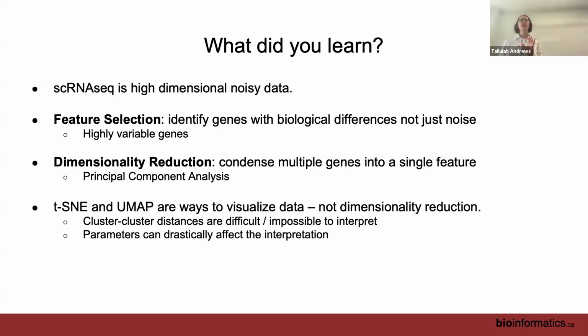It's sort of in between a dimensionality reduction method and a visualization method, because it's trying to preserve some degree of distances in the data, but it's very focused on trajectories. So it's quite good at representing trajectories. It does not perform well visualizing clusters, so it's really only used when you're looking at trajectories in your data. But it also reduces the dimensions.